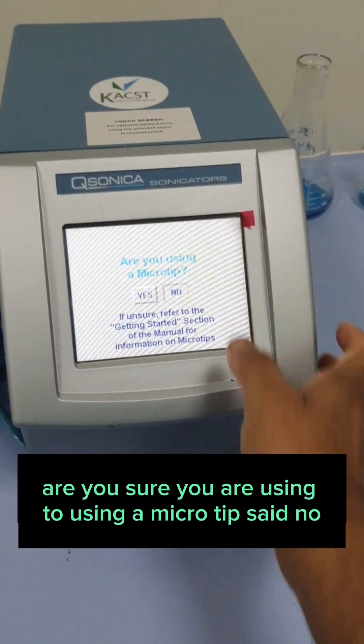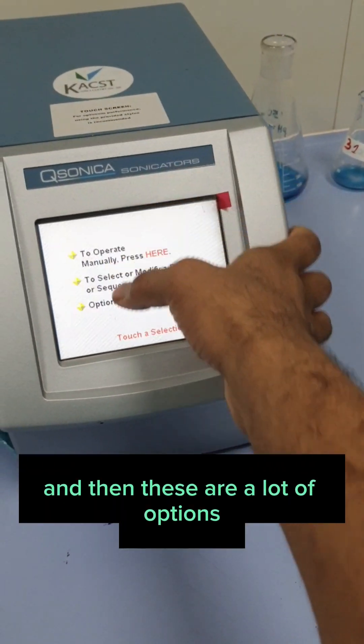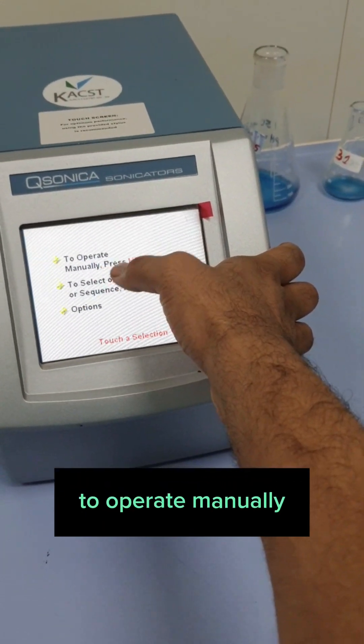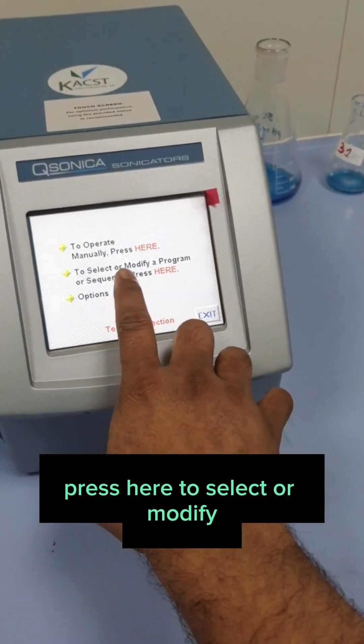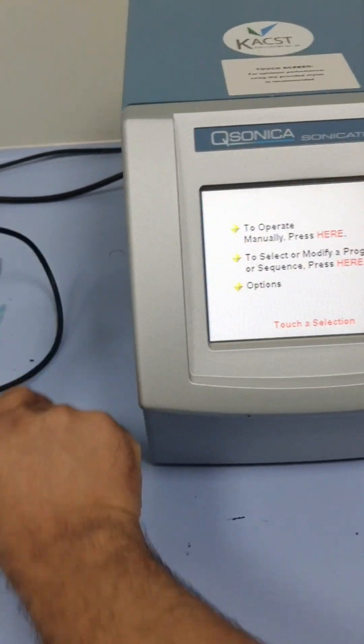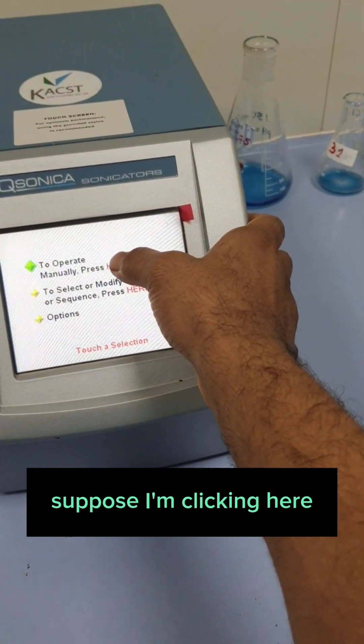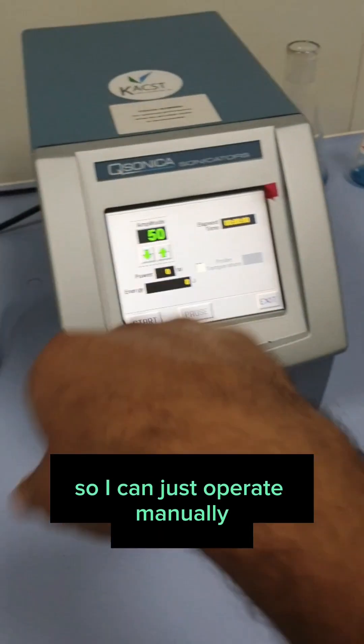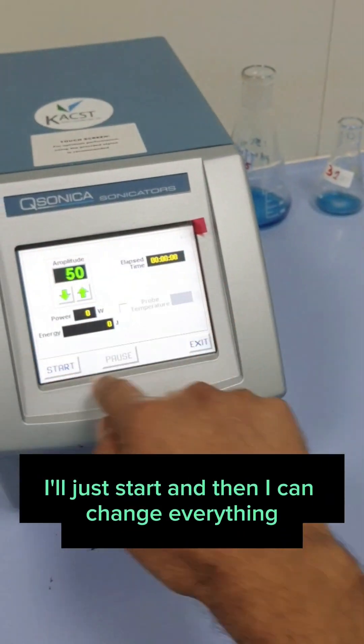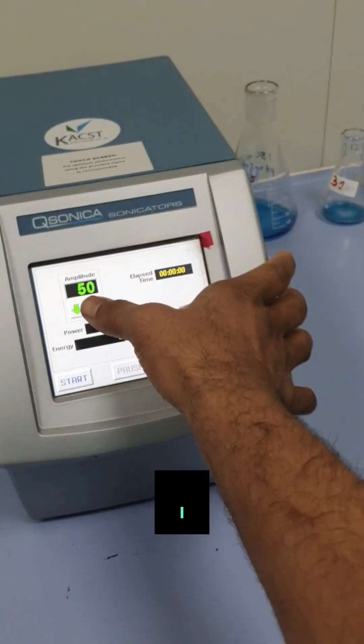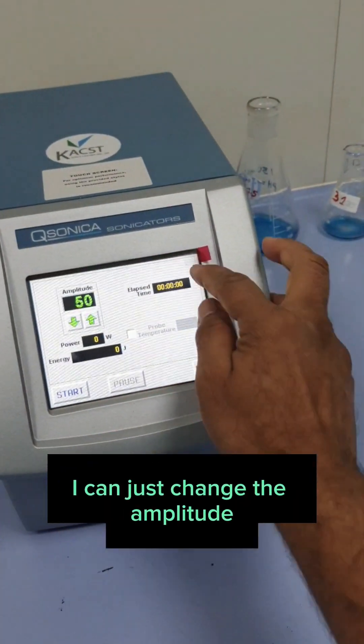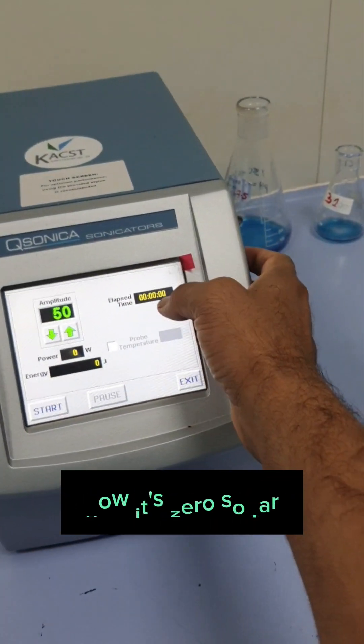There are a lot of options. To operate manually, press here. To select or modify, press here. There are a lot of options. Suppose I'm clicking here. I can just operate manually. I'll just start. And then I can change everything. I can just change the amplitude. And time elapsed will be here. Now it's zero.